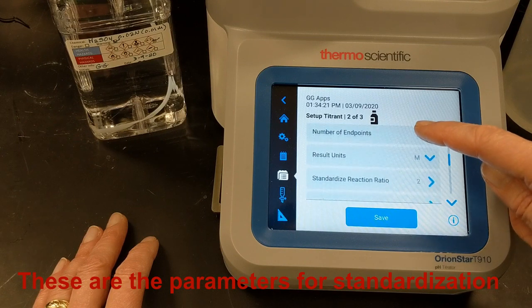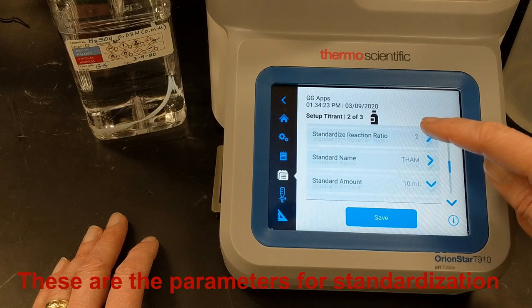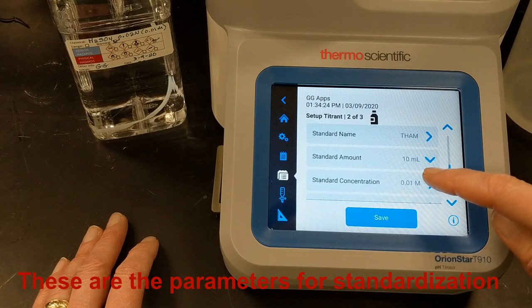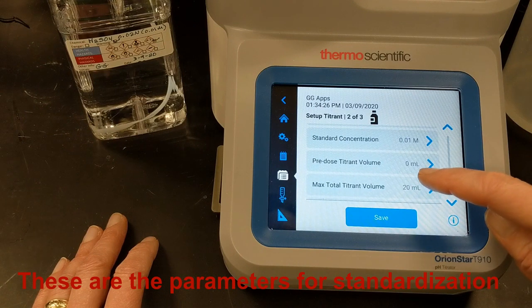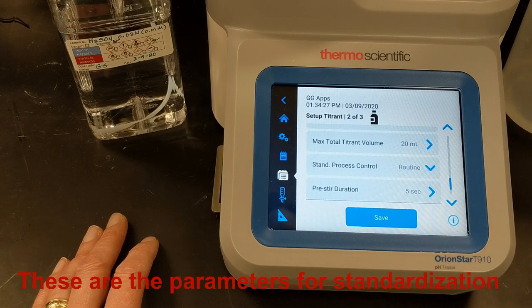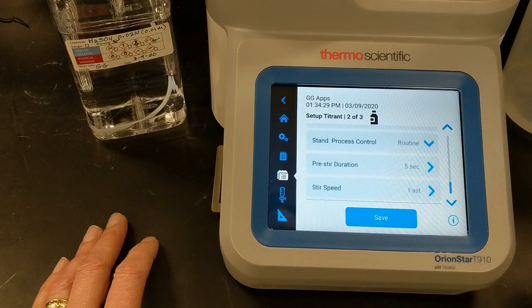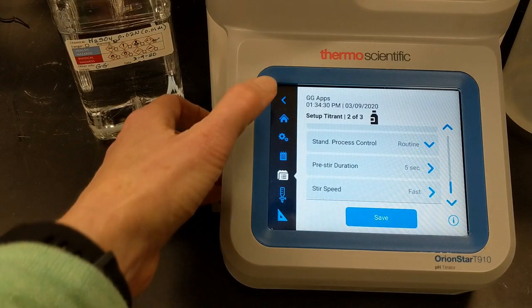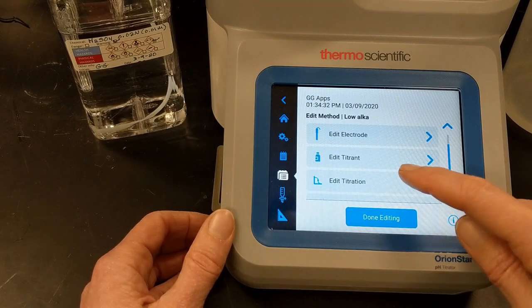The reaction ratio is 2 moles of THAM, or TRIS standard, to 1 mole of H2SO4 titrant. I'll titrate 10 mL of the standard. The titrant predose is 0 mL, the maximum titrant volume is 20 mL, and the process control will be routine. There's a 5-second pre-stir and a fast stir speed. The back icon brings me back to the edit method screen, and lastly, I'll view the titration setup.